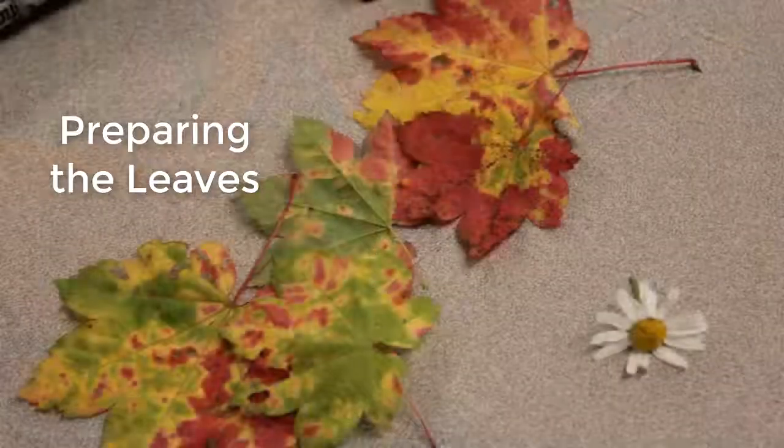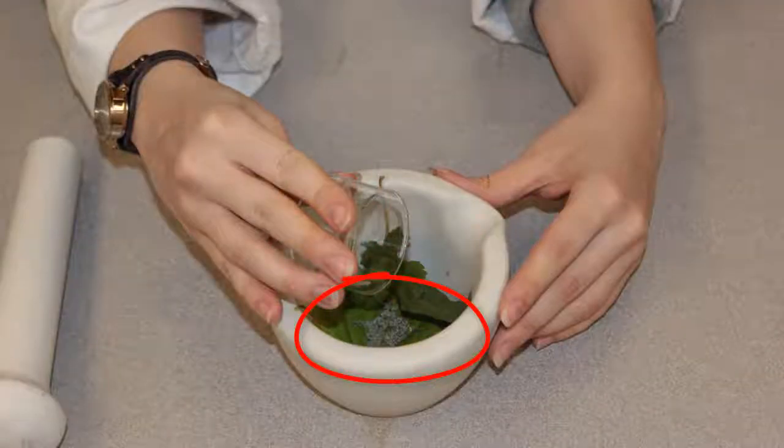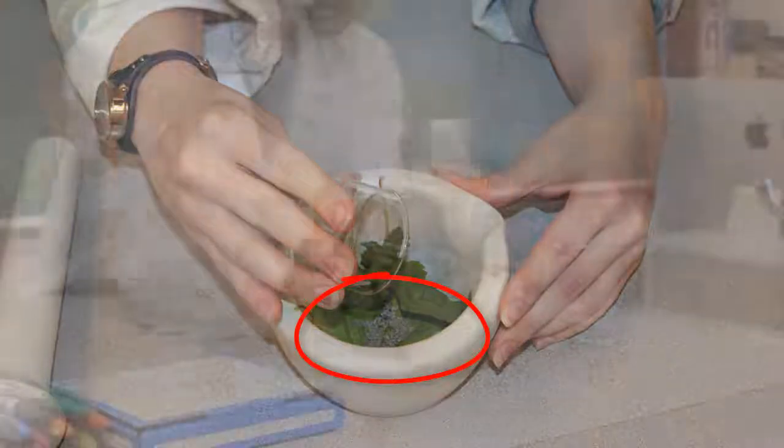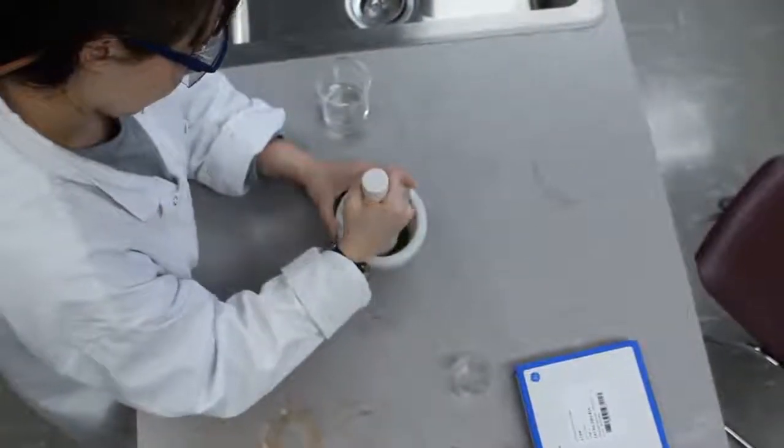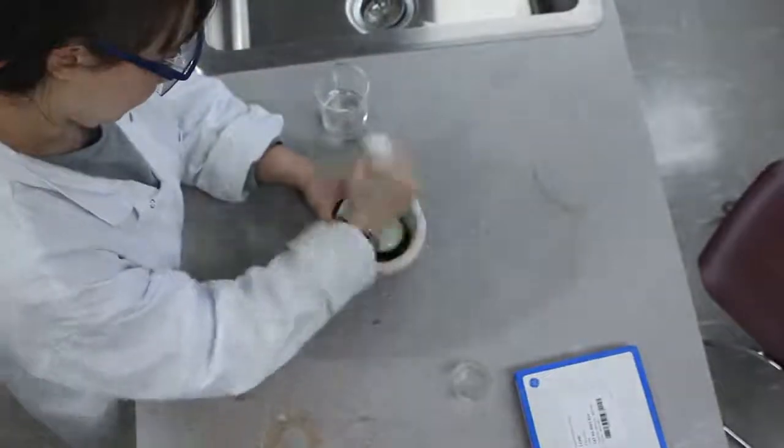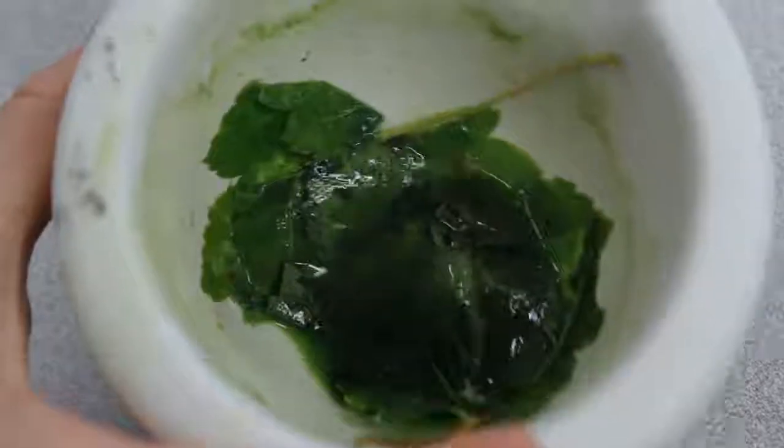Now it's time to prepare the leaves you're going to be separating the pigment from. Add your leaves to your mortar and pestle along with a little bit of sand for grinding and cover the mixture with a bit of acetone just to make the whole thing moist. Grind with your mortar and pestle for about 10 to 20 minutes until you have a concentrated solution of your plant pigments. The longer you can grind, the better solution you'll get.